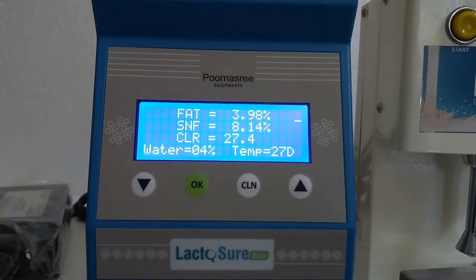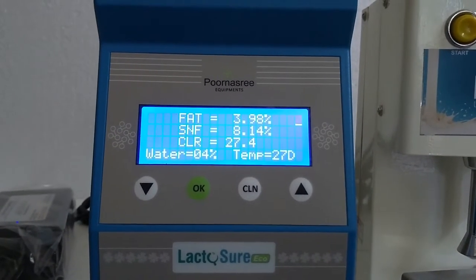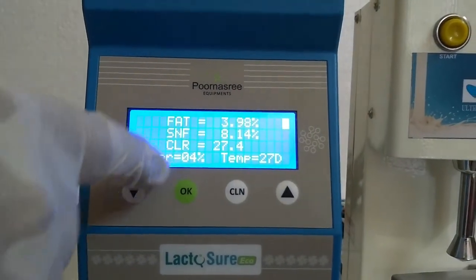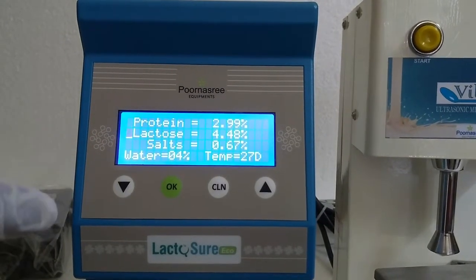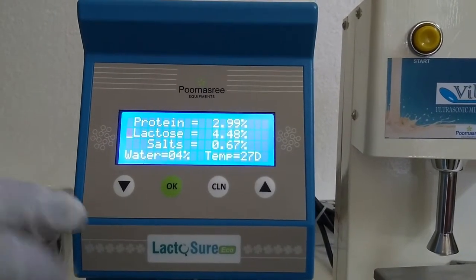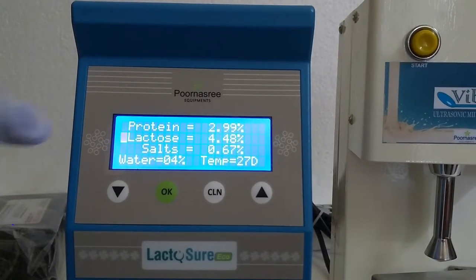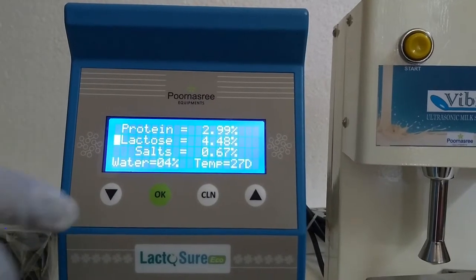The result is now showing on the screen. There are 8 parameters displayed: fat, SNF (Solids Not Fat), CLR, water, temperature, protein, lactose, and salt — 8 parameters in total. From these we can identify the quality of the milk.